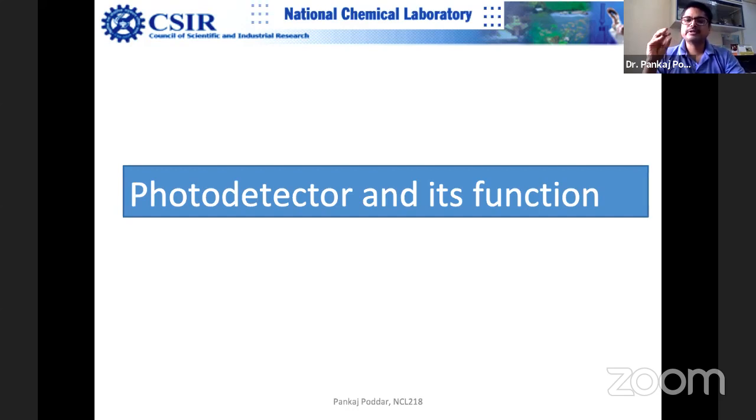So over a period of time, the tip gets worn out, it becomes blunt, it collects all the debris, so tip size increases. So the image quality suffers if you are just using the same tip or you're not careful. Tip cleaning itself is a very careful task. Suppose you give to some institute, please do the AFM on my samples. So are you really careful what kind of AFM tip was used? What was the spring constant? What were the dimensions of the tip?